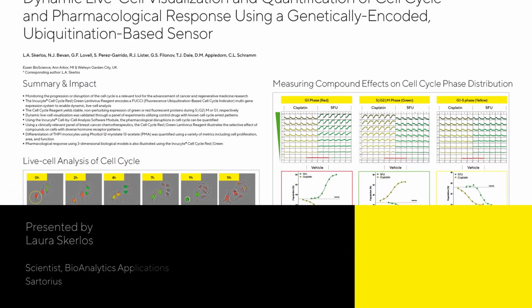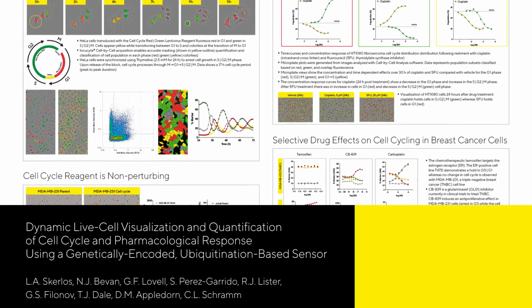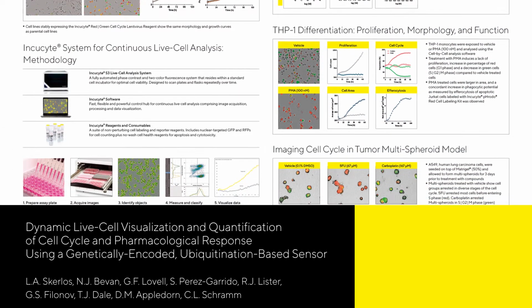Today, I'll be presenting a poster entitled Dynamic Live Cell Visualization and Quantification of Cell Cycle and Pharmacological Response using a Genetically Encoded Ubiquitination-Based Sensor.